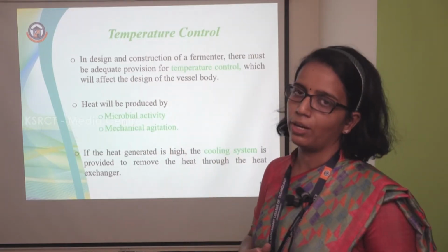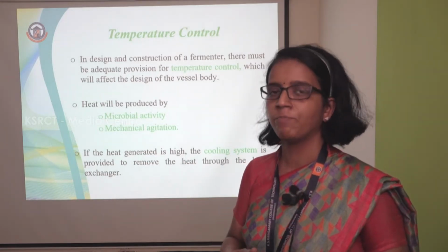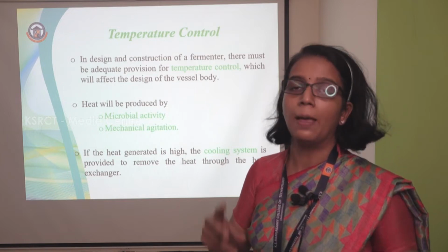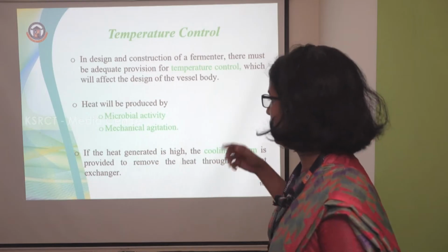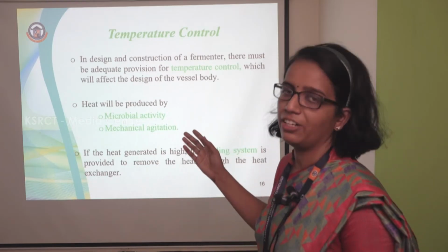Next, an important parameter is temperature control. Temperature control is essential as heat is generated during the fermentation process, mainly because of two things: one is agitation and another one is microbial growth. Let's see how to work on this particular heat reduction system.